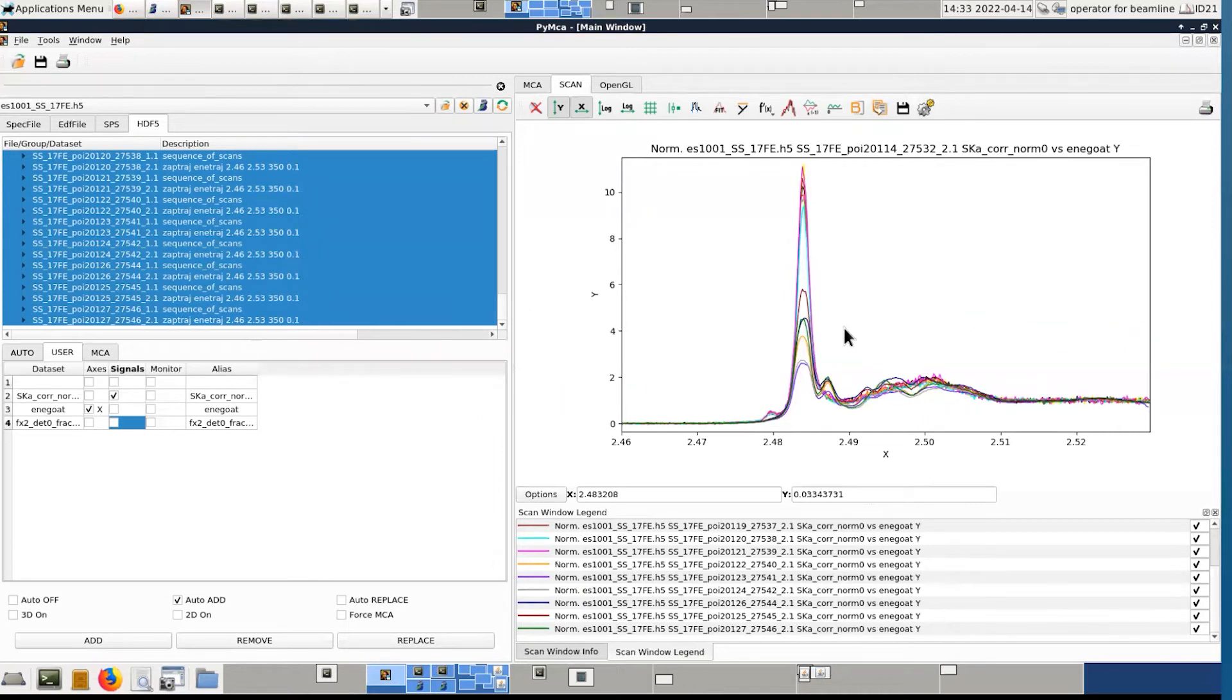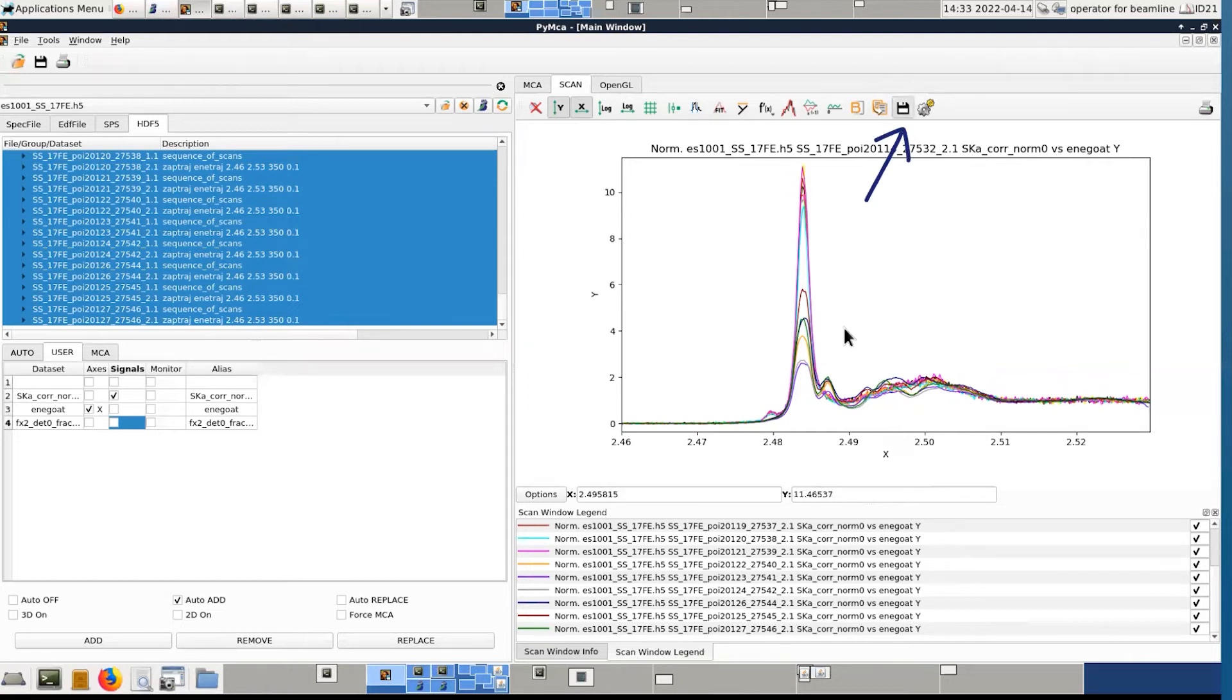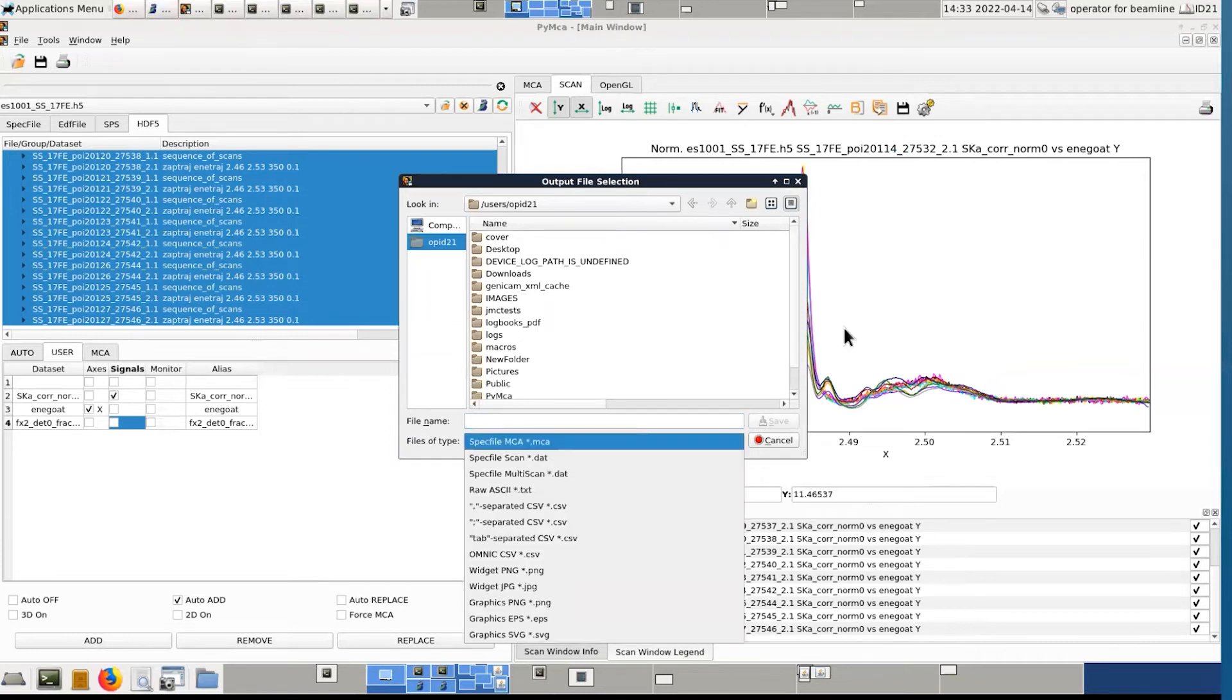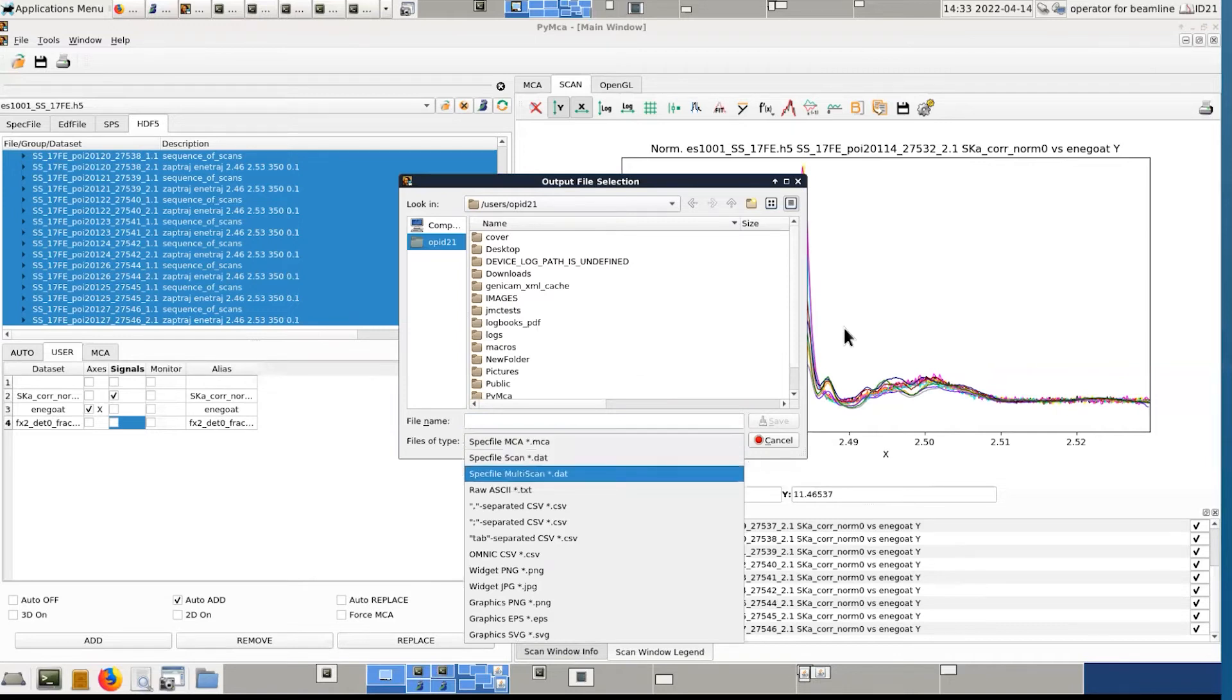This is only for display. Nothing has been saved. But if you would like to save this, you have here an option. Here you would save independently each spectrum. But in this precise case, you may be interested in this multi-scan saving, where you have all the scans which are displayed, which are saved in a unique file.